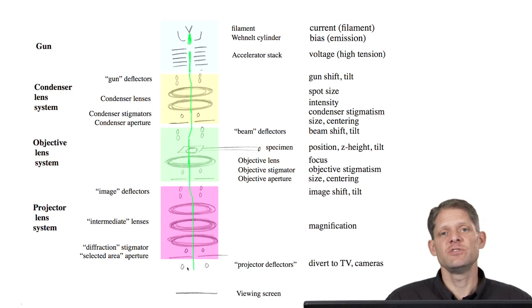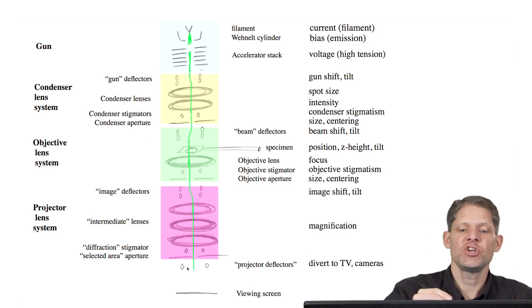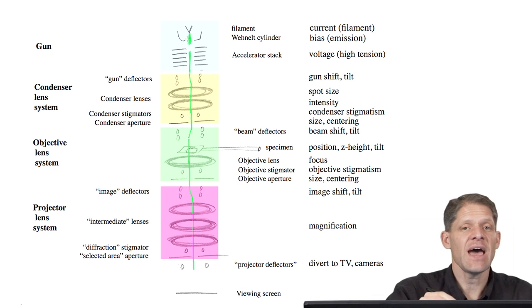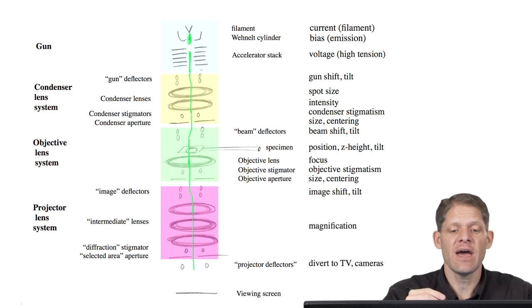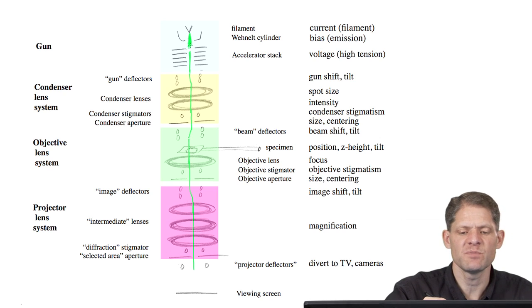Now, as the microscope is used each day, those alignment parameters can vary for a number of reasons. One is, for instance, that the shape of the tip can change over time. Exactly which parts of that sharp tip the electrons are coming out of can change subtly the direction and the number of electrons coming from each position.